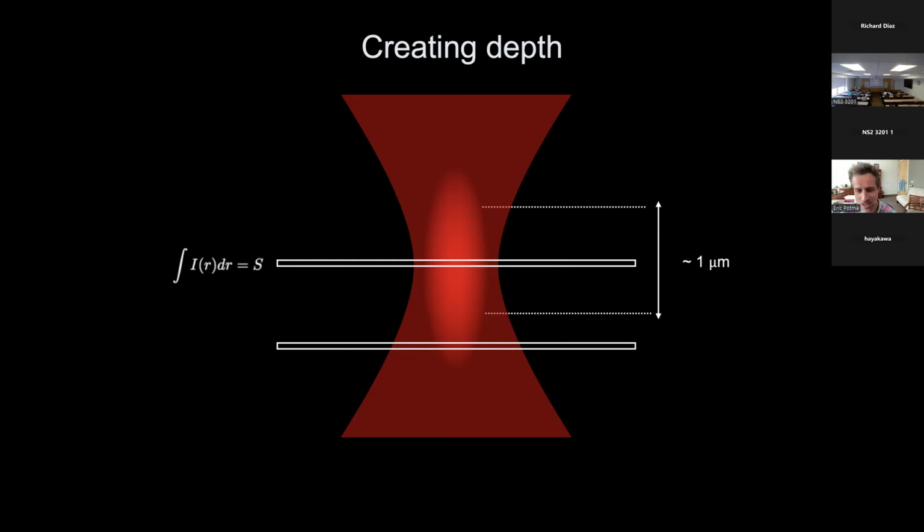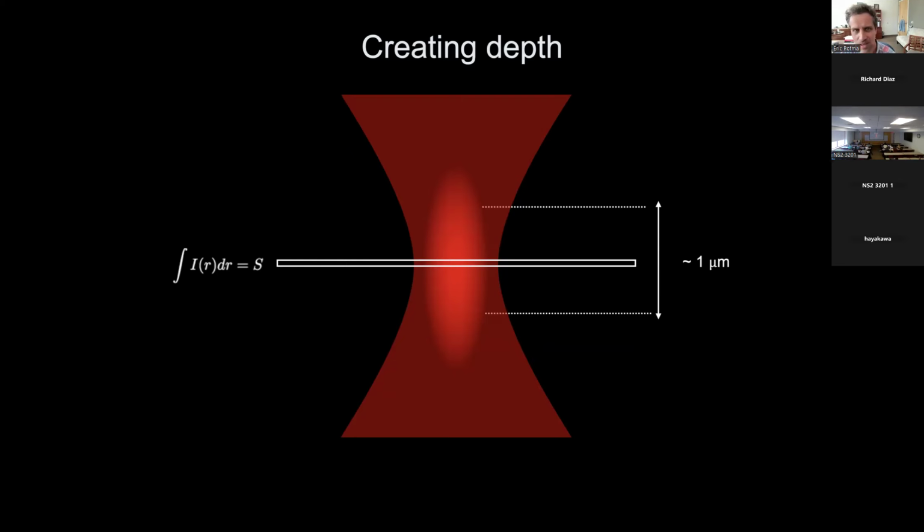Who knows what is the intensity in this plane below it? I mean, basically, the question is it lower in intensity, higher, or maybe the same as the intensity of the plane over here? It's 0.2 times lower than the central intensity. Two times lower, I hear. Sorry, root 2 times, not 2 times. Square root, somebody says. Okay. Well, that's a good guess, but it's not correct.